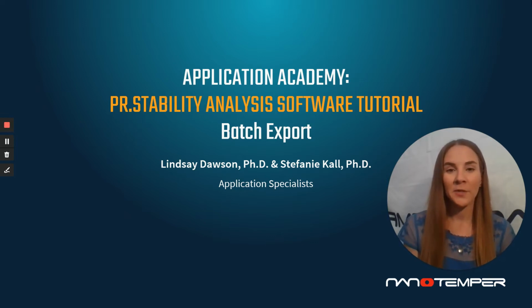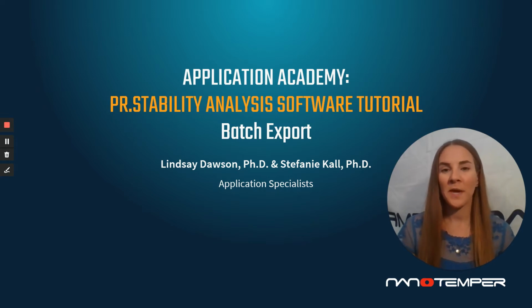In our last tutorial, we're going to be covering the various export options that you have available to you in the software. Now, we know it's great to be able to streamline your actual data analysis using our software, but we know that eventually you're going to have to present this data to, say, either your colleagues or your boss, or just record it for your records.